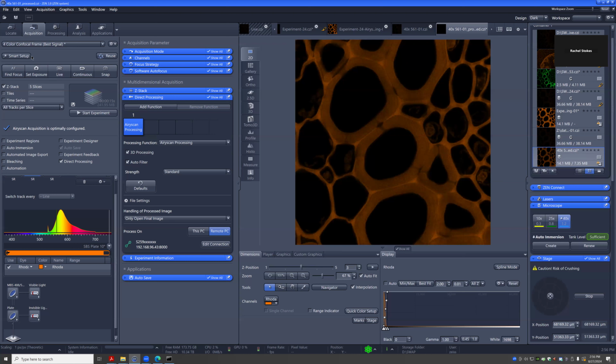And again, we'll do a follow-up session, and I think for both of you, you have very similar samples, right? So we'll use one of your samples to go through the workflows that you want to do on that, and then give you some time to play around and see how things look.